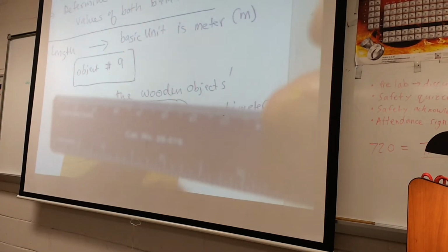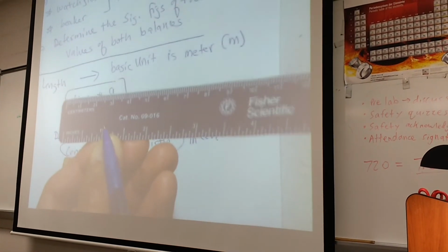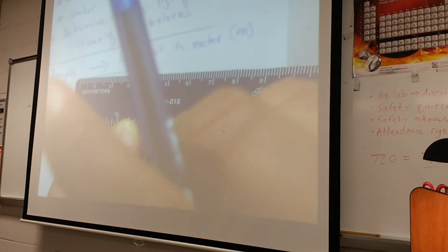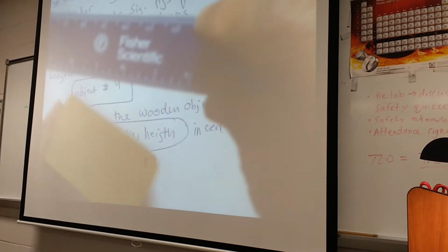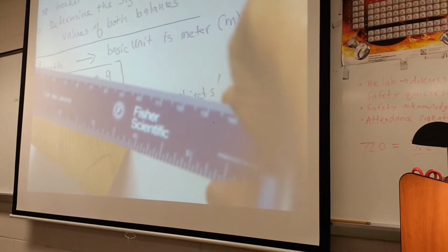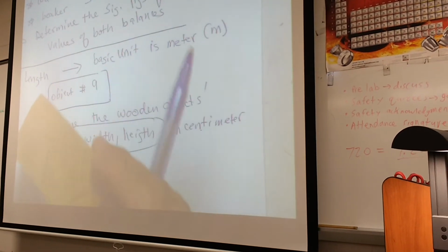If you look here, I have 1 inch, and if I go up one inch, it has to be 2.54 centimeters. So 2.54 centimeters is 1 inch. This ruler has both the English and metric systems. As I said, it's crude, not really precise. I would need a Vernier caliper, special equipment, to get very precise data. But for the sake of training, I'll go here.